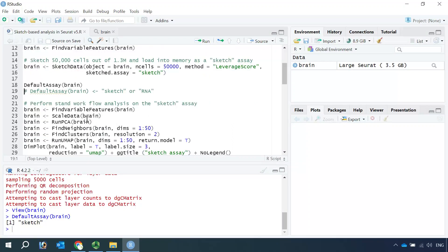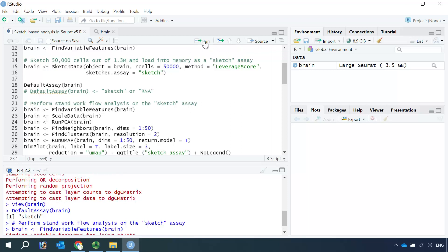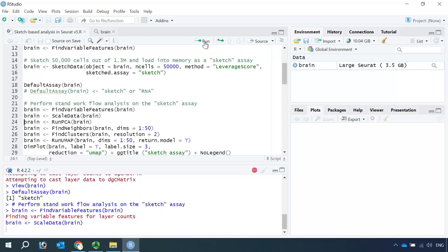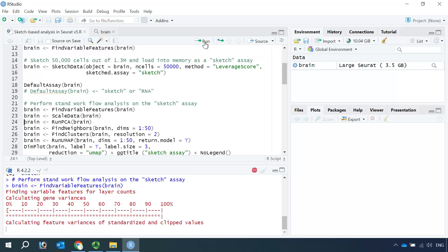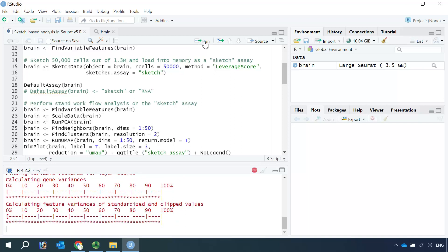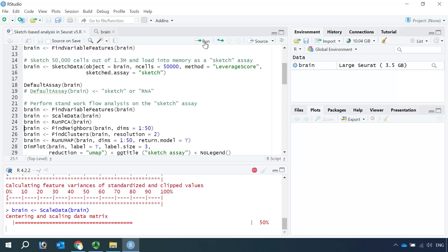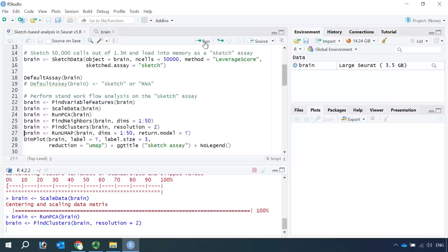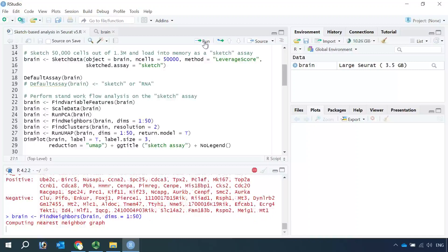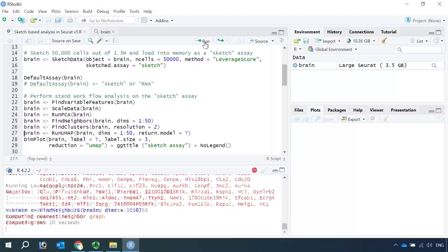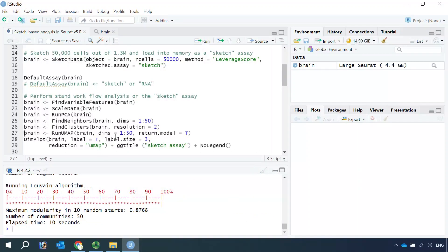Now we can run the standard workflow analysis on the sketch assay. First, we find the variable features for the sketch assay. Then scale the data. Then run PCA. After PCA, we find the neighbors and find the clusters. You can see, with resolution 2, we identified 50 cell clusters in the sketch assay data.